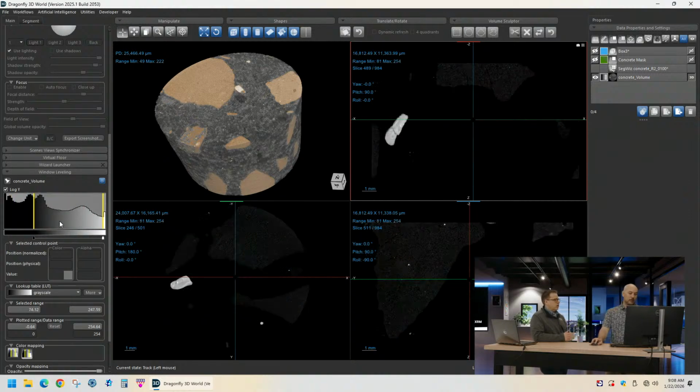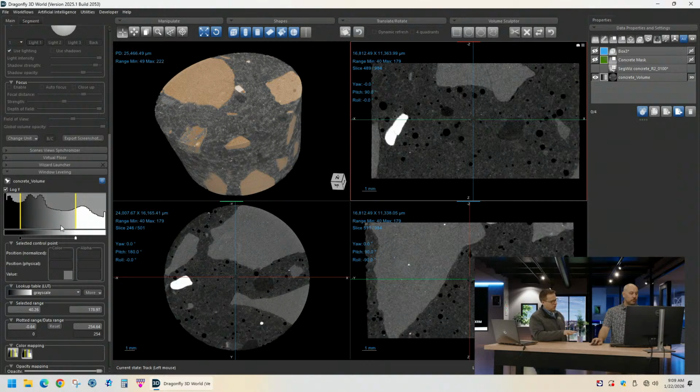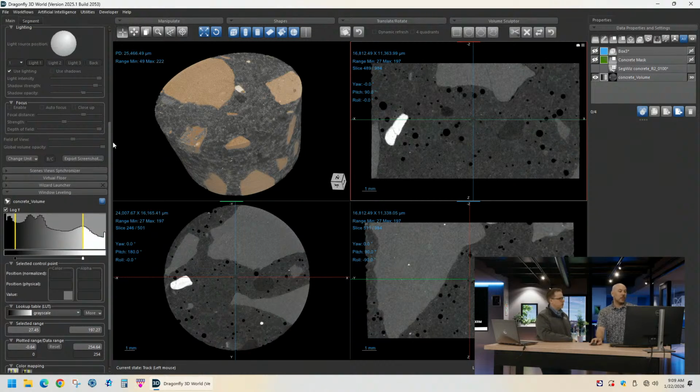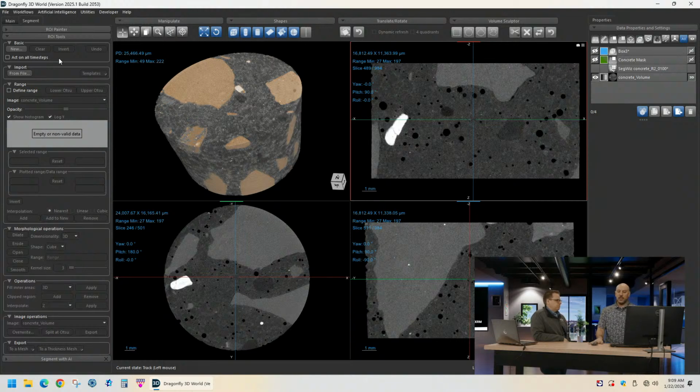Okay, so now with that, let's say that we want to start this journey of turning our awesome looking data that we see things in to help the computer to identify it with segmenting. So now what do we do? What's our first step? Yeah, so now we're going to go into segmenting. We did a little bit of this last time. Go over to the segment tab.